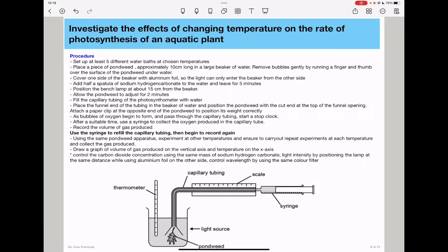The aquatic plant we're going to use is a pondweed, and the experimental setup is as we can see here. We have a beaker of water with a thermometer inserted to measure the temperature. This is the pondweed that we're going to experiment on, and it has been cut. The cut end is positioned to the entrance into the capillary tube.